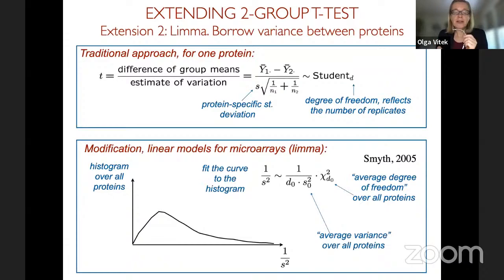And so Limma is really helping with the stabilization, but for many experiments in proteomics, especially in multiplex proteomics, the signal part of Limma is actually not quite adapted to what we would need.